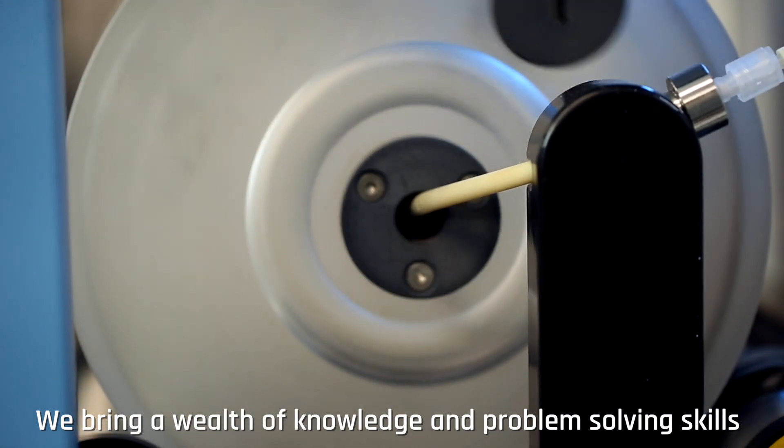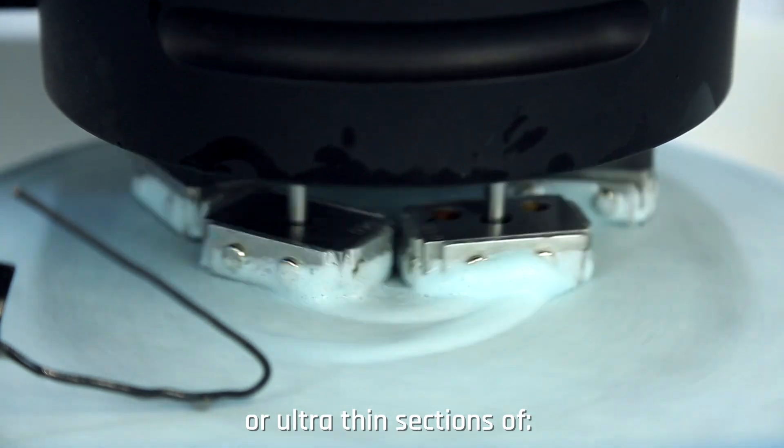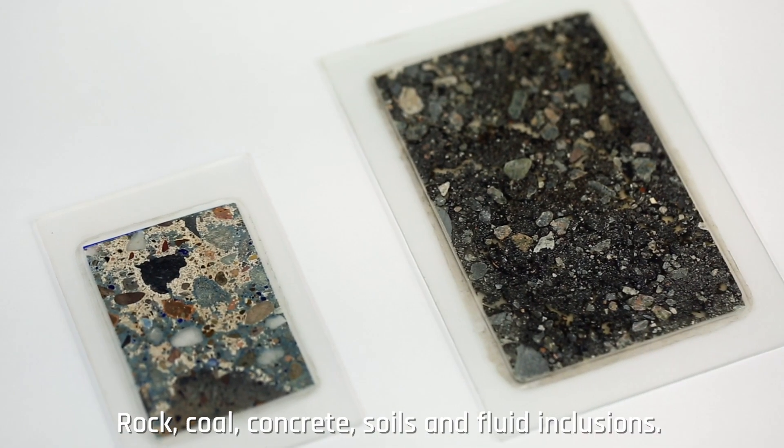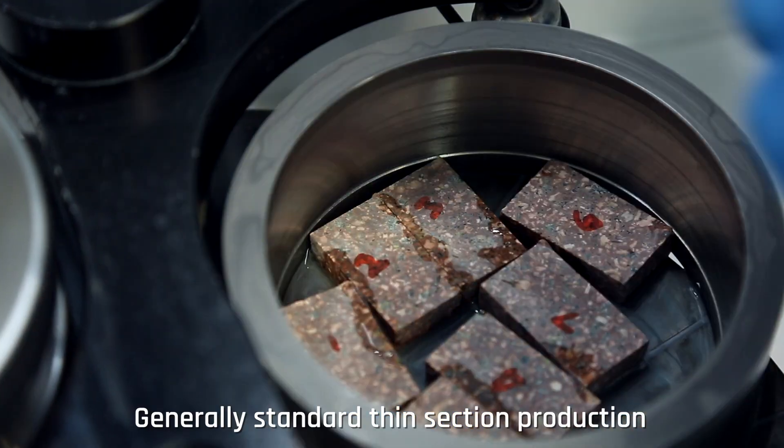We bring a wealth of knowledge and problem-solving skills in producing high-quality geological thin or ultra thin sections of rock, coal, concrete, soils and fluid inclusions.